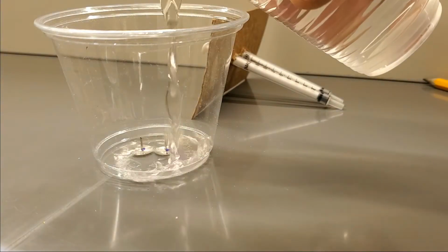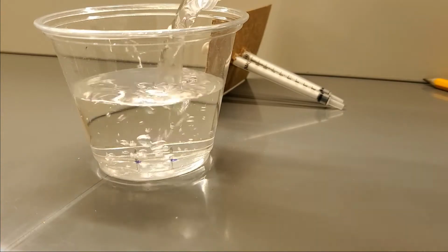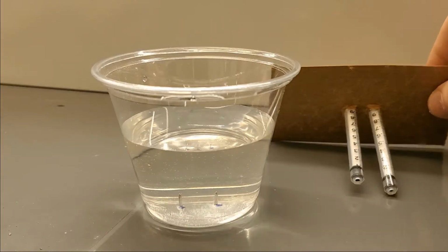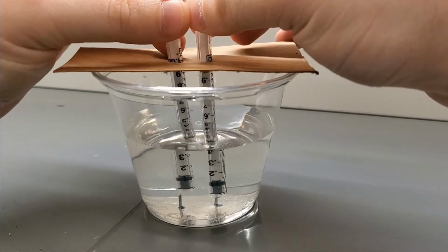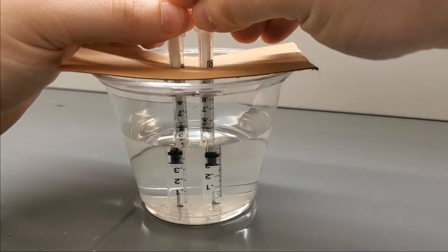Gently pour the electrolyte into the electrolysis apparatus. Lift the cardboard and syringes into the electrolysis apparatus and then place the syringes with their trim tips over the thumbtacks. You might need to pull up the plungers in order to get them to fit.